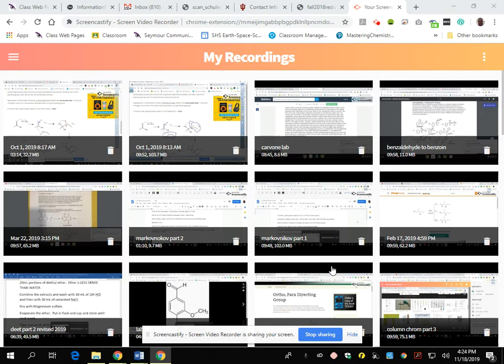If you treat a molecule from paper production called lignin, of course, it's a plant-based product, you get large quantities of vanillin, which is obviously the chemical responsible for the characteristic aroma of vanilla beans. So our development manager, Woody Aspen, has asked us to develop a method to reduce vanillin to vanilla alcohol.